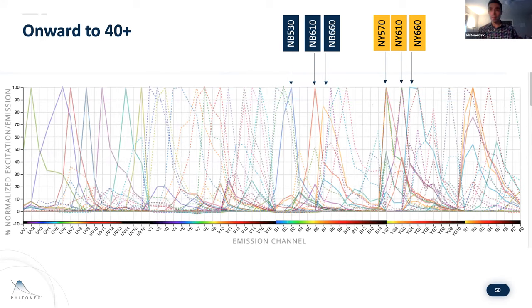And I think notably, remember, with this notion of clean fluorescence, we're able to stack even within current high-plex panels. So if you're running at the 12 to 18 and you're on either this or another type of instrument, you can actually think about stacking these as additions into current panels. I don't have the data just yet because we just finished titrating the antibodies, but we'll be sharing some of these high-plex experiments very shortly. From a paradigm point of view, it's very important to think about how you would incorporate these into current panels.